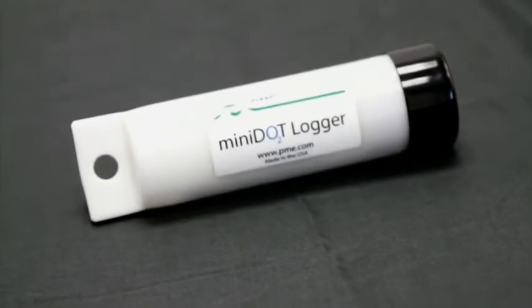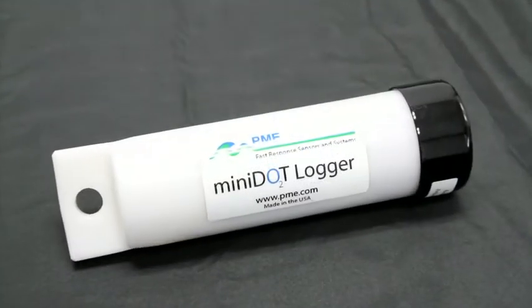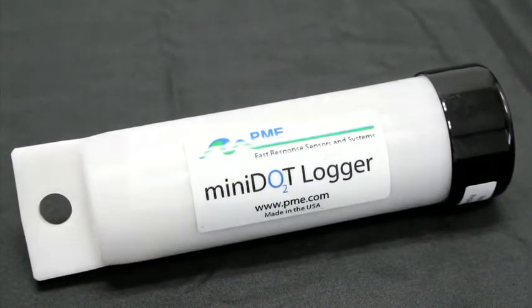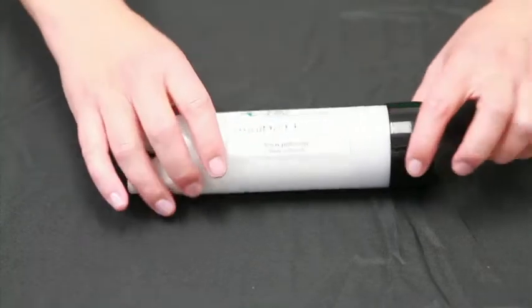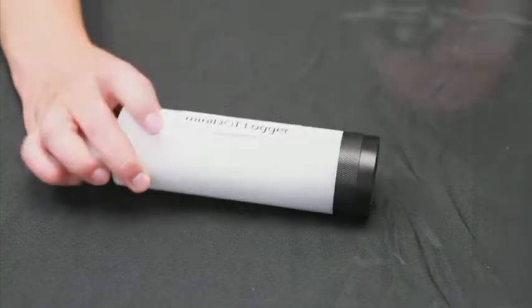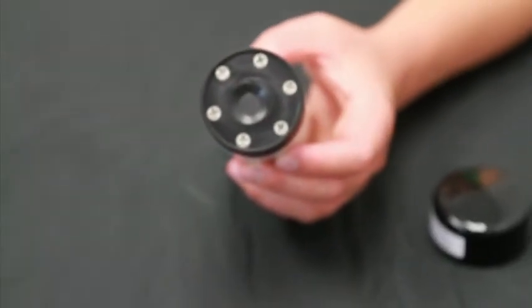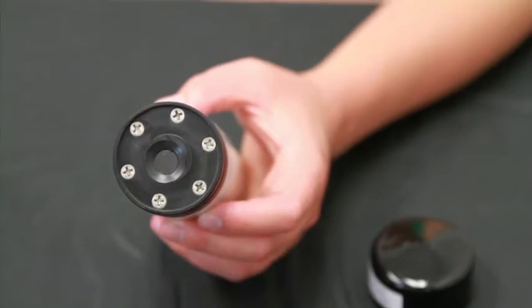This is a quick tutorial for operating the mini dot logger. A few things to note: the black vinyl cover protects the sensor. Remove the cover before using the mini dot and then replace it for storage. Do not remove any of the six screws on the face of the black end, as removing these screws will result in damaging the mini dot.